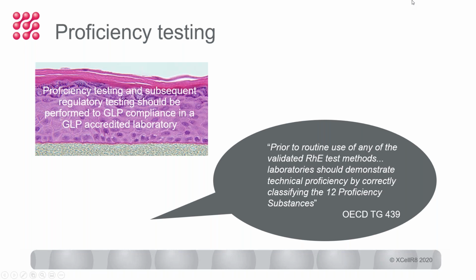Okay, there you go. So just to complete speaking about the reconstructed skin methods, I just wanted to make a few comments about proficiency testing. Whichever test lab you're working with, it's really important to make sure that proficiency testing has been carried out in compliance with GLP in order for any of the studies that are done for you to be fully GLP compliant.